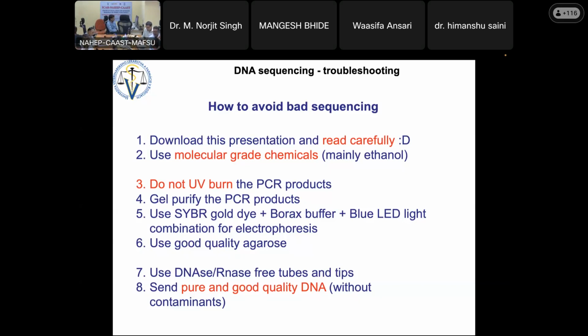Unfortunately, you cannot use DEPC water, but freeze thaw could also help. And always send pure and good quality DNA to the company. Unfortunately, filters get clogged in autoclaving, so freeze thaw is still usable.